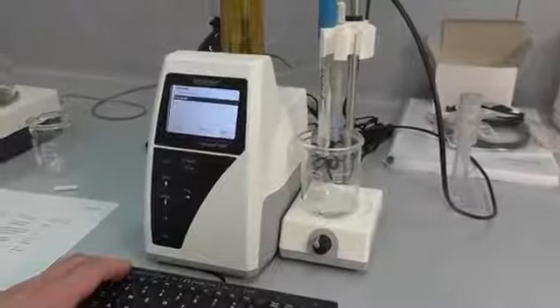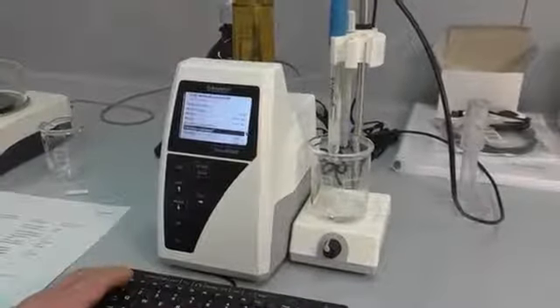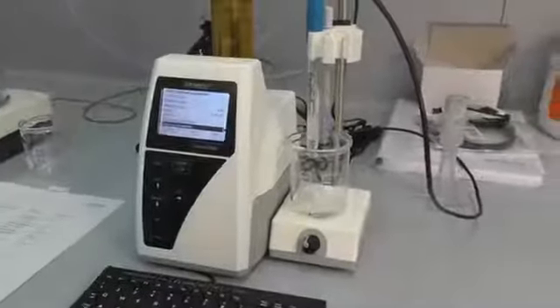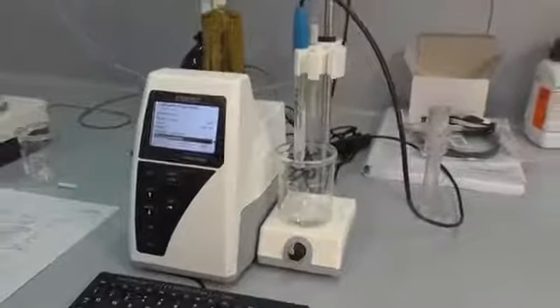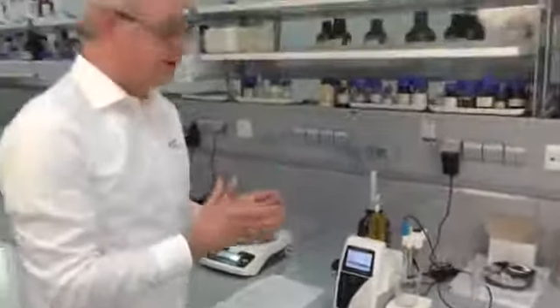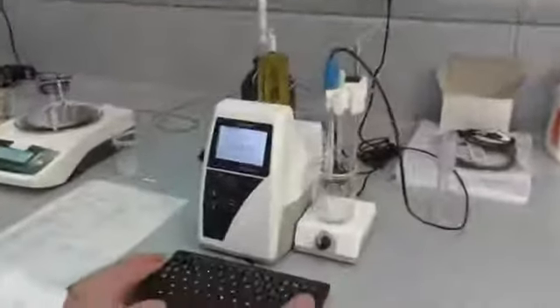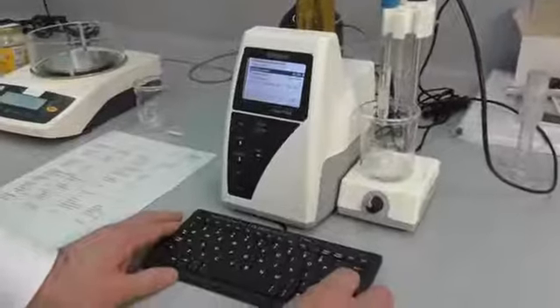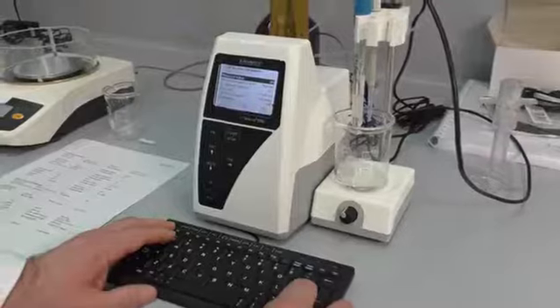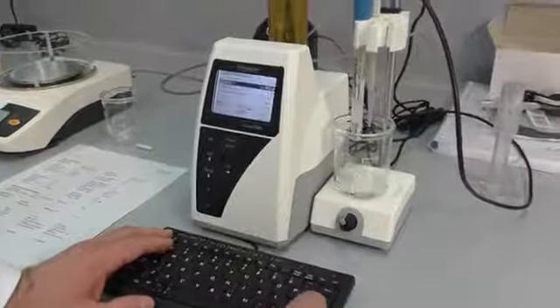and that's fine. Next we have to change the dosing speed and the titration parameters a little bit, because if we use the standard parameters from the total acidity in juice, the titration will be too fast and over-titrate. We will change the endpoint.